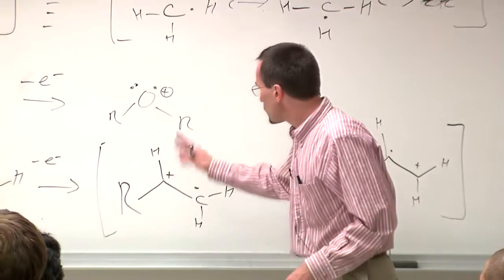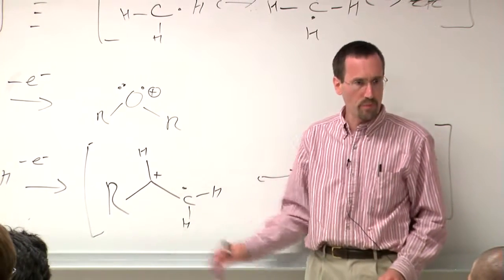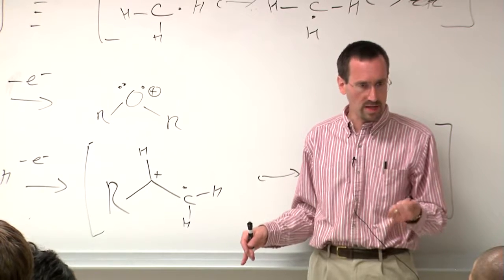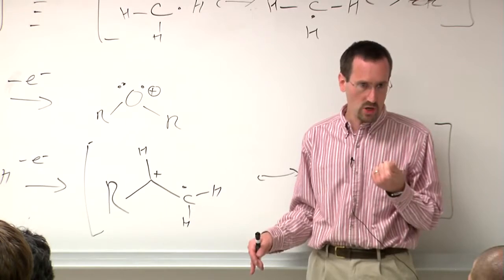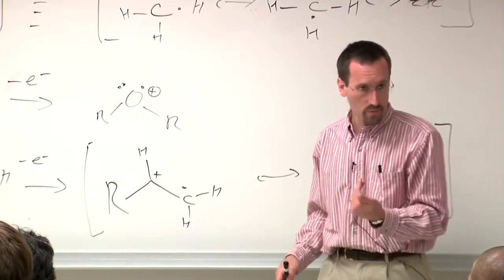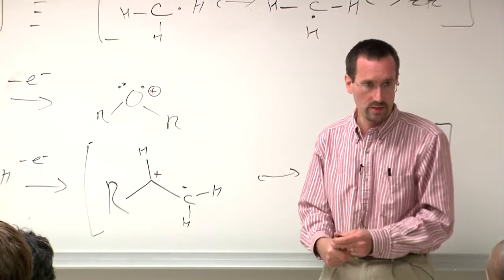When one of these radical cations breaks apart into 2 halves, one half will end up with an even number of electrons and a positive charge. The other half will end up with an odd number of electrons and no charge. And the radical, because it doesn't have any charge, won't be deflected and won't show up and won't be detected because the detection depends upon detecting an electrical current.